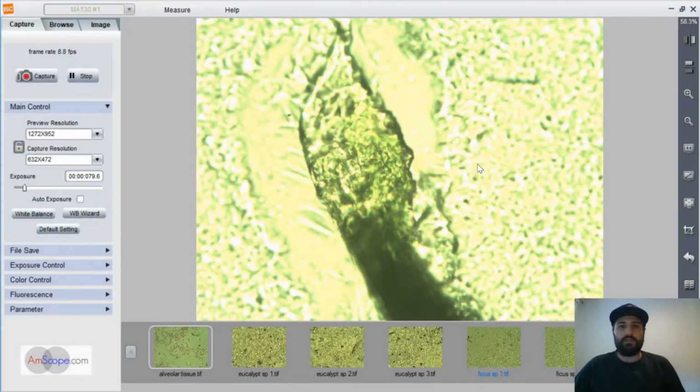So following some very unskilled work, I guess, both a bit out of our depth there, Mr. Ellis and me. I haven't done it for a while, and Mr. Ellis hadn't really done it with that particular microtome, but you can see that it can produce a slide where you can start to see some definition.